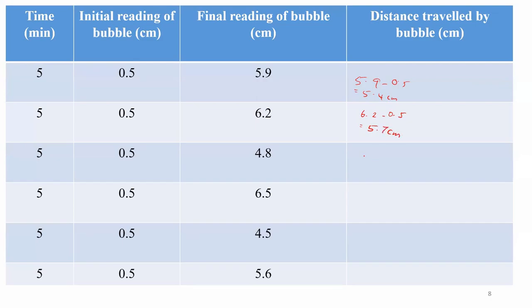Here, the answer is 4.3. Here, 6 centimeter. Here, 4 centimeter. Here, 5.1 centimeter. You understood.